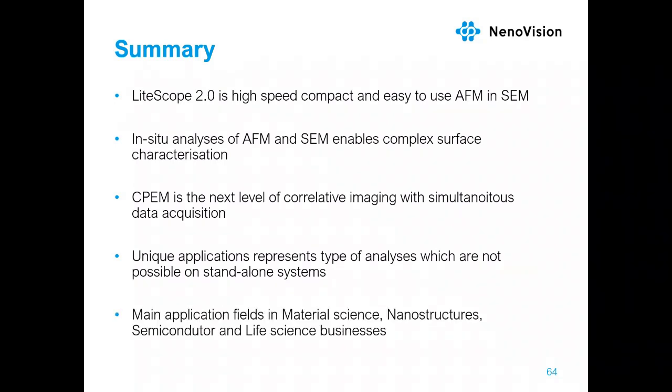By the end, I was trying to show you some examples of where we see the main application fields: material science, nanostructures, semiconductors, and life science businesses.